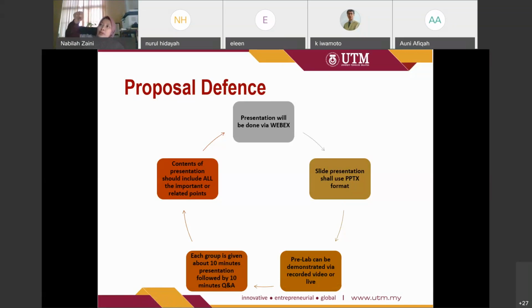Pour 2 gram of solid compound in the round bottom flask and then swirl it. So you can explain and demonstrate to us by drawing. You can use PowerPoint, the whiteboard, or any medium. It is up to you, as long as we understand what you are demonstrating during the presentation session. However, you need to present to us within the stipulated time frame.